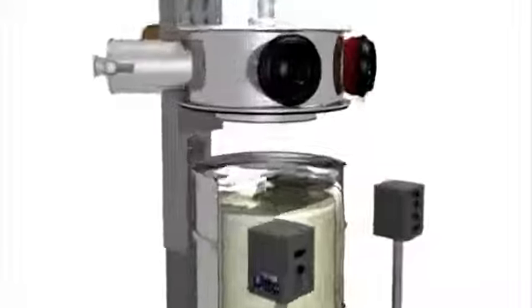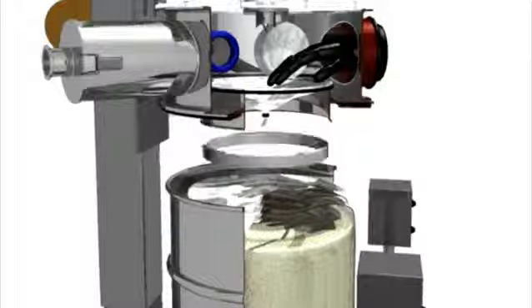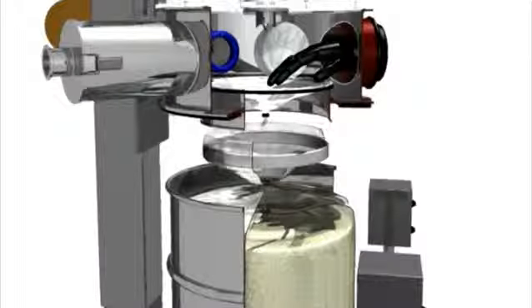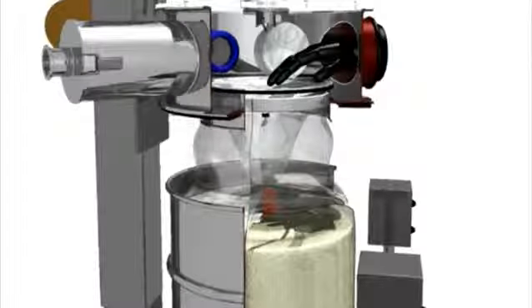Dec has worked very hard to keep the operation of the DCS very simple. As can be seen here, before the drum is raised, a simple push ring is used to connect the outer primary bag in the drum. Then the outer liner is opened and the DCS glove box is lowered onto the drum.